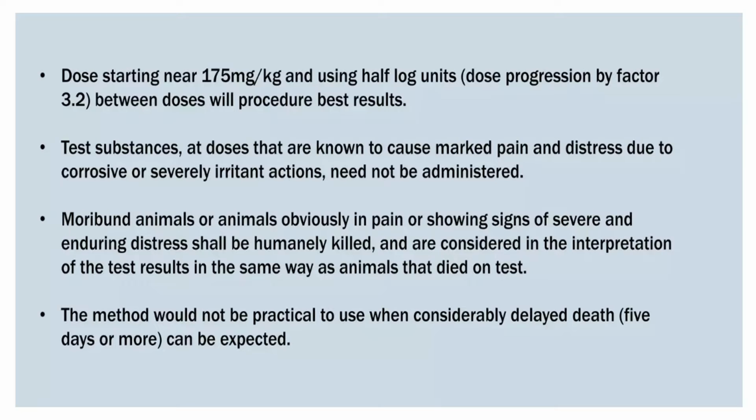If after dosing you find the animal in any morbid condition or showing irritant behavior or distress, you have to kill that animal. But before killing, you have to see if it is showing any sign of suffering.